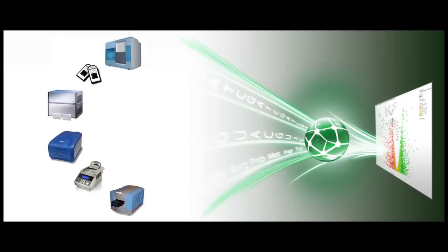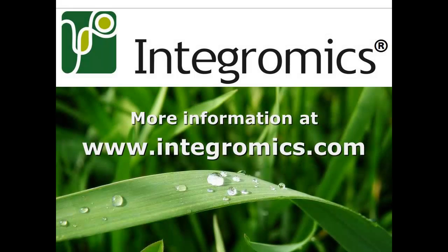In this era, in which data analysis is increasingly becoming the bottleneck of many genomic studies, we at Integromics are working hard to provide the researchers with the best tools to address this problem by bringing the data analysis and visualization powers of Spotfire into the world of biology.